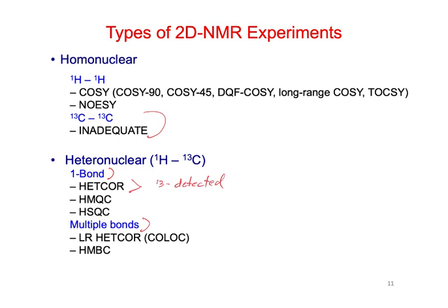That has the disadvantage of being much less sensitive, right? But we'll see in a minute that there was a thing that made the proton detected experiments complicated to do in the beginning. So these two are proton detected. Like I said before, because we did the C13 detected first, the proton detected ones were called inverse detection. There's a similar thing for the multiple bond experiments.